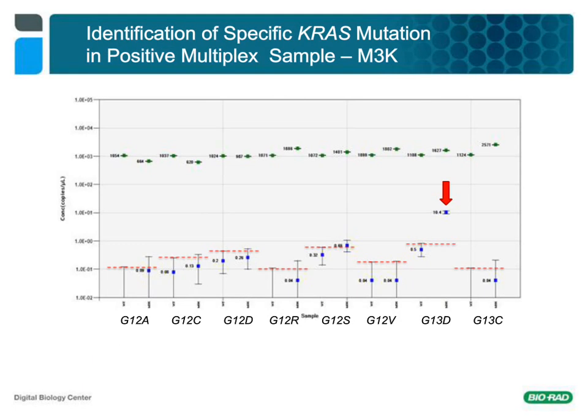Further analysis using individual duplexed KRAS mutation assays identified the mutant patient sample as KRAS G13D. Wild-type controls were used with each assay to identify the correct false positive rate for each assay, and the positive calls were made by non-overlapping 95% confidence interval error bars. Since we did not have enough sample left to screen all of the individual mutations, and we had already determined the absolute concentration of the sample, we used the Advanced Preamp Supermix from Bio-Rad to generate enough sample to identify the individual mutation type.